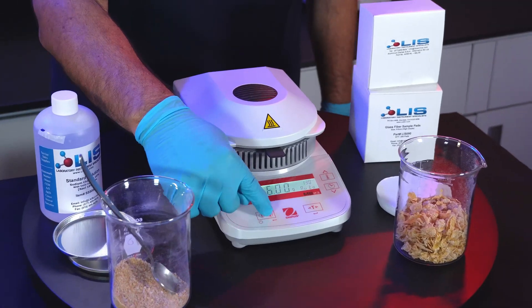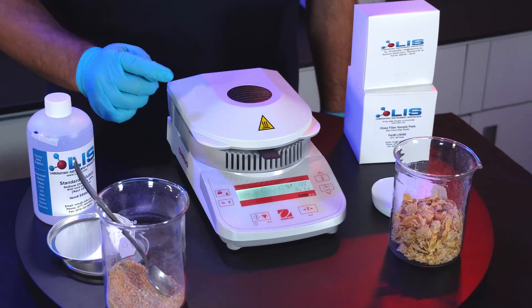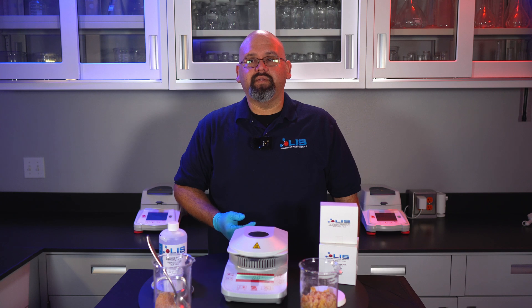Close the lid and press the start button. The test will take anywhere from 10 to 15 minutes. When done, it will flash a result for you.